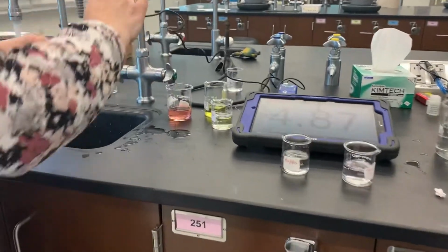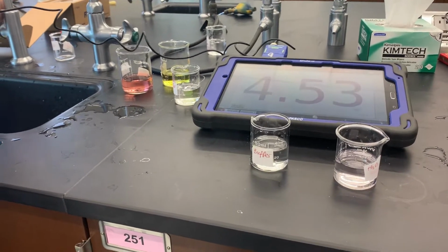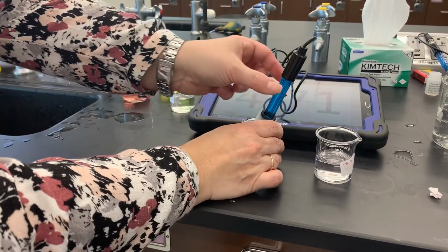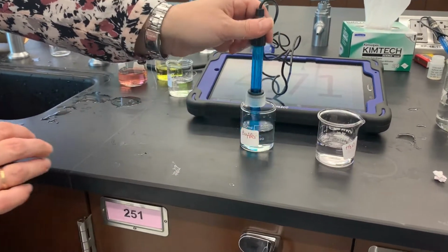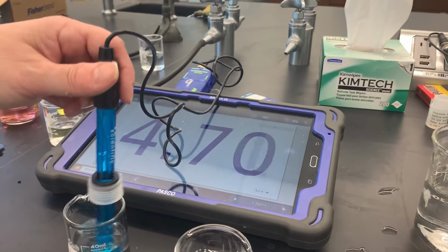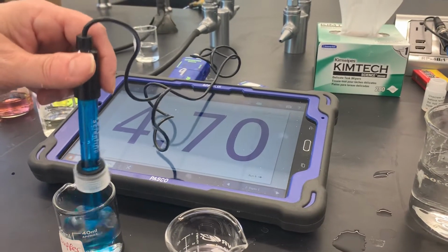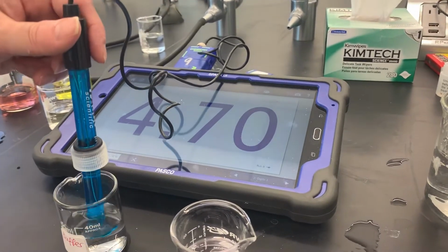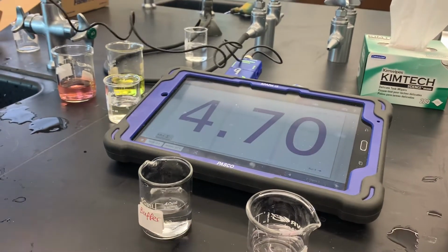We're going to start with buffer. So now we took our original buffer that had pH of about 4.6, measured. And now this buffer has base in it. So pH did go up, but as you can see, it didn't go up by very much. It's now reading 4.7, so it started with about 4.6 or so, and now it's up to 4.7. So obviously we're adding base, so pH has nowhere to go but up, and it did go up, as you can see.